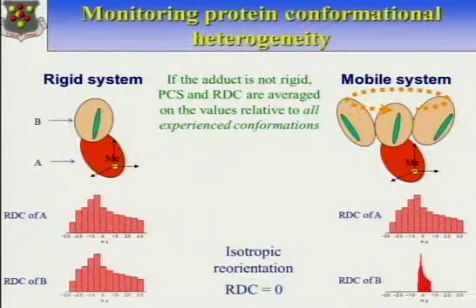And then we mix them up, so we construct ensembles of configurations with different weights for each configuration, whereby by computing the weighted average of all this data, we satisfy the experimental restraints.